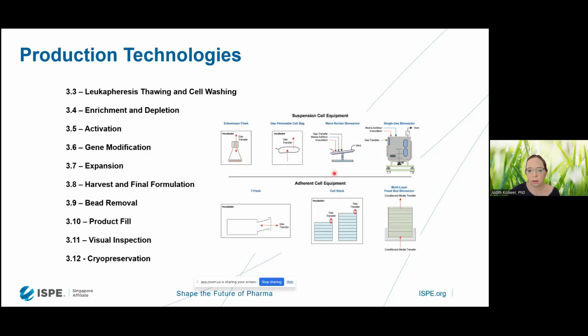provide a substance for our cell bag mostly to perform a rocking process that would usually be done, for example, by operators, but in a more controlled way. And then, of course, a single-use bioreactor, where we have really a programmable piece of equipment that allows us to, for example, select the program over the next days. And here we are usually seeing single-use kits.